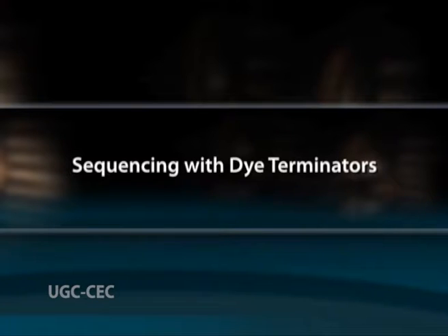Sequencing with dye-terminators. Fluorescent DNA sequencing can also be performed using a chemistry in which the dyes are attached to the ddNTPs, thereby requiring only 1 reaction tube per sample instead of 4. Since only 1 reaction tube is required for the dye-terminator reaction, this chemistry is simpler to use than dye-primer chemistry.